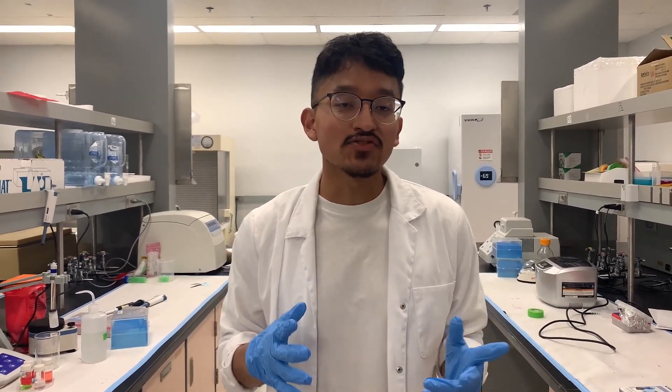Hello my fellow science hustlers. Today in this video I will be showing you how to extract nuclei from plant material for analysis under flow cytometry.